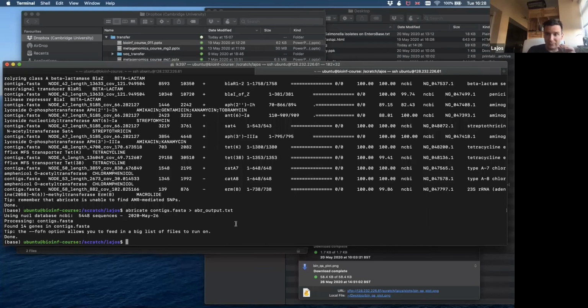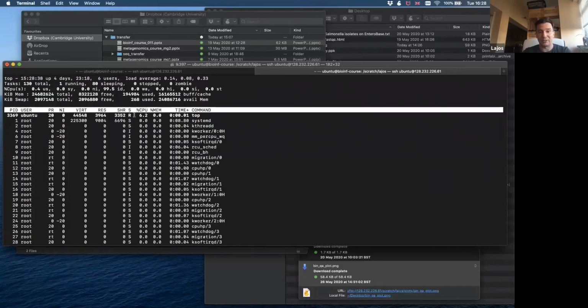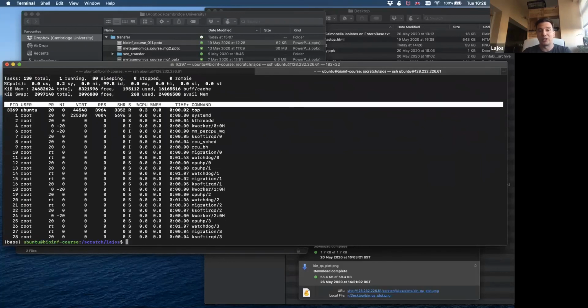Before we start doing de novo assembly and realignment on Thursday, which we already spoke about last time, I just want to give you a few extra pieces of information. If you have any questions now, or if you want to run any of these programs, even CheckM in the background, just feel free. Always check if someone else is running. If you see top and there is nothing running, there is no CPU usage, just feel free to start your runs.